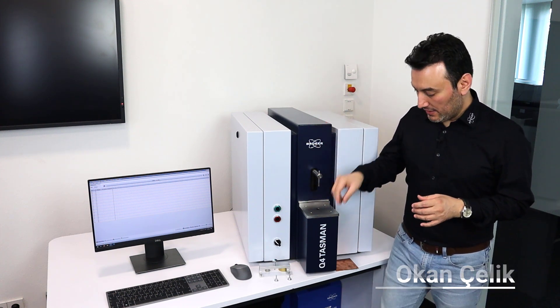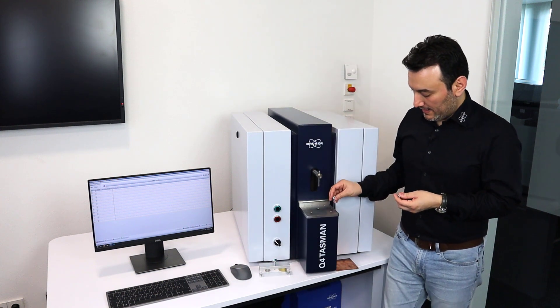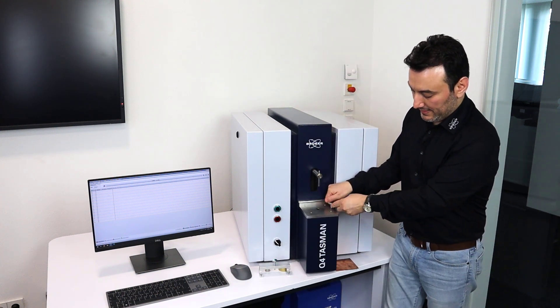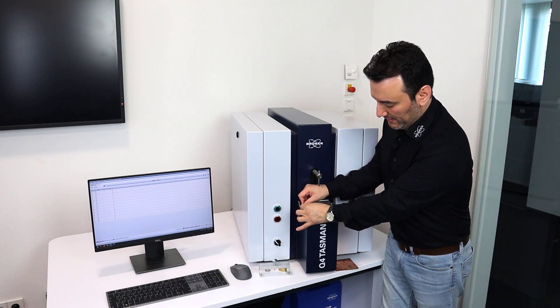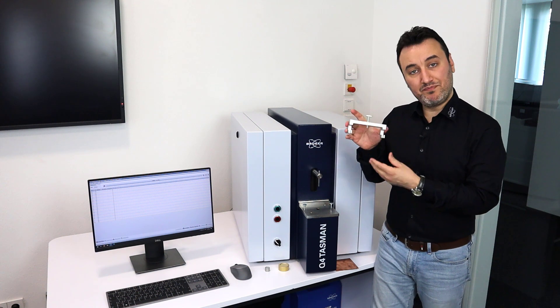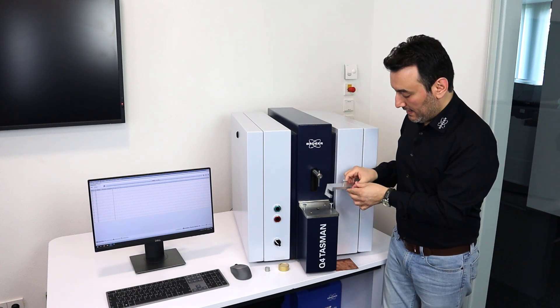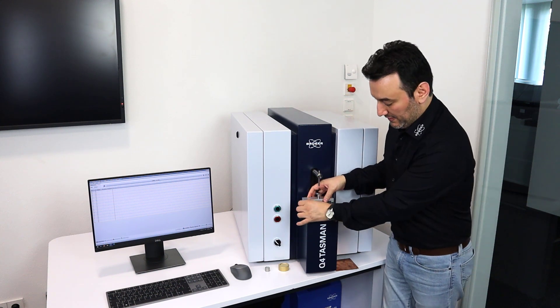The next adapter I'm going to show you is the metal sheet adapter for the Q4 Tasman. I take these two screws and place them on my spark stand plate — just a little bit at the beginning — and then I take this piece. It is a bridge-like piece and I place it here and push it all the way to the front.